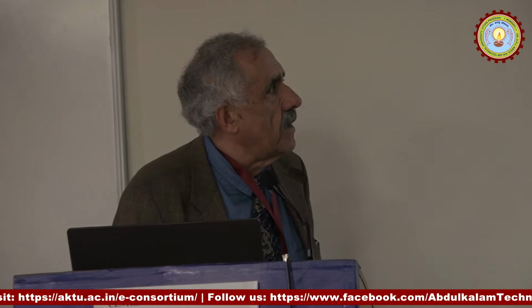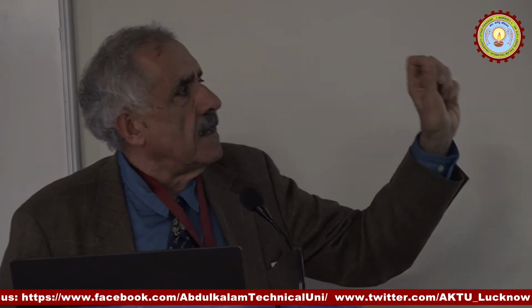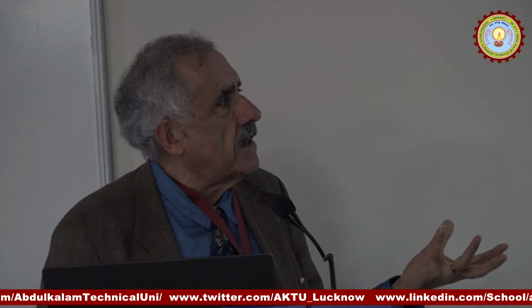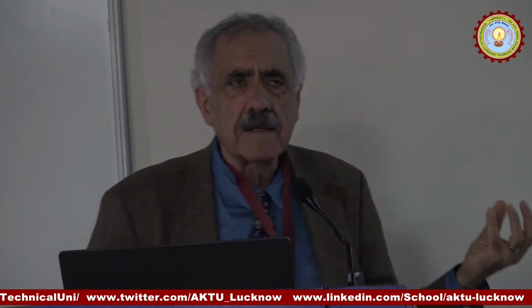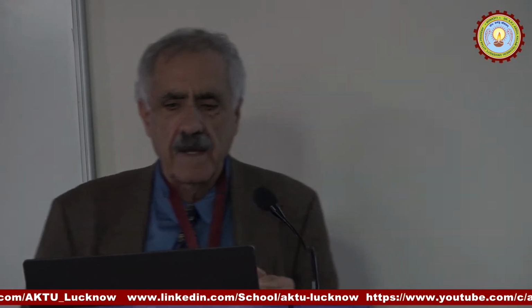Okay? Now this is part of a set of papers where we combine theory and microscopy to study a lot of these things, and we predicted with theory that these nanowires are metallic, and then subsequently we found a way to verify that experimentally. But these are my demonstrations of what this microscope can do.